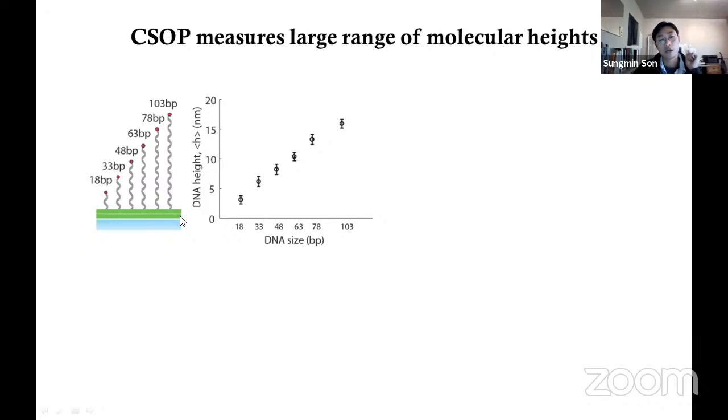And then I would add a very small amount of each DNA into a well so this DNA can spontaneously incorporate into the membrane. So now I have several beads immobilized on the surface that have red fluorophore and green fluorophore, which I can characterize by a radius to measure the offset, which is my size measurement here.